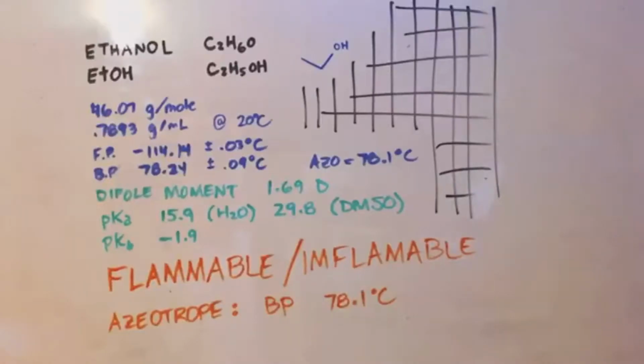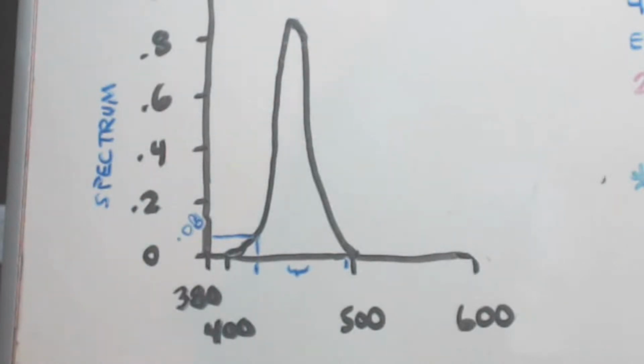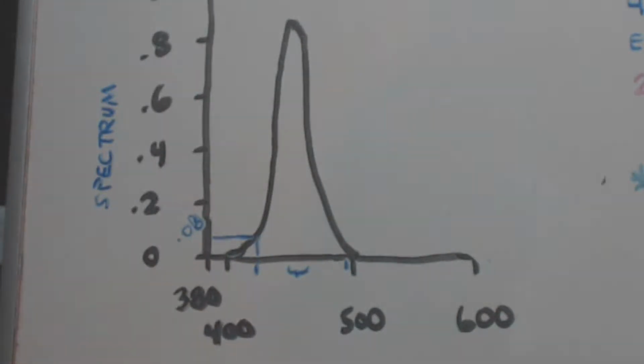This is John Black, super chemist, showing you how to get anhydrous ethanol. I already did a video where I actually take some vodka, azeotrope distill it, and then use molecular sieves to dry it out so it's totally anhydrous. But this video is just going over several different methods of ways you could do it.